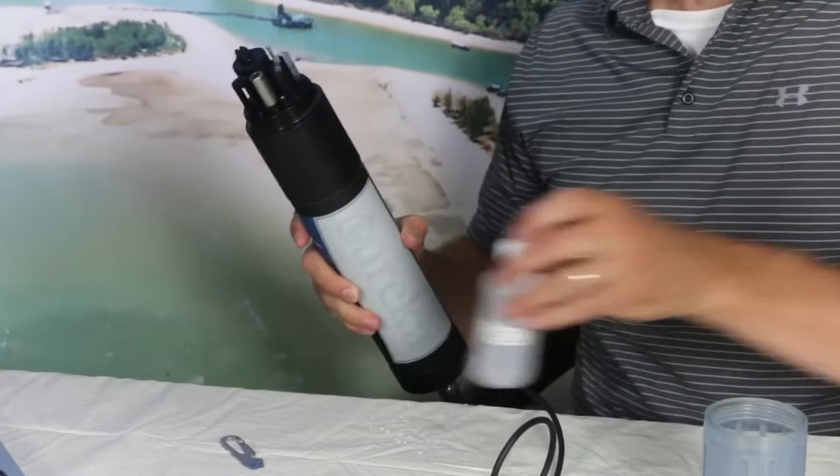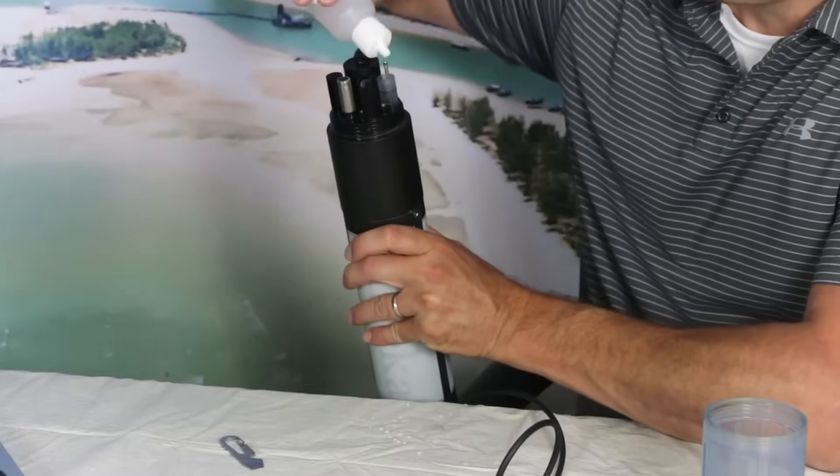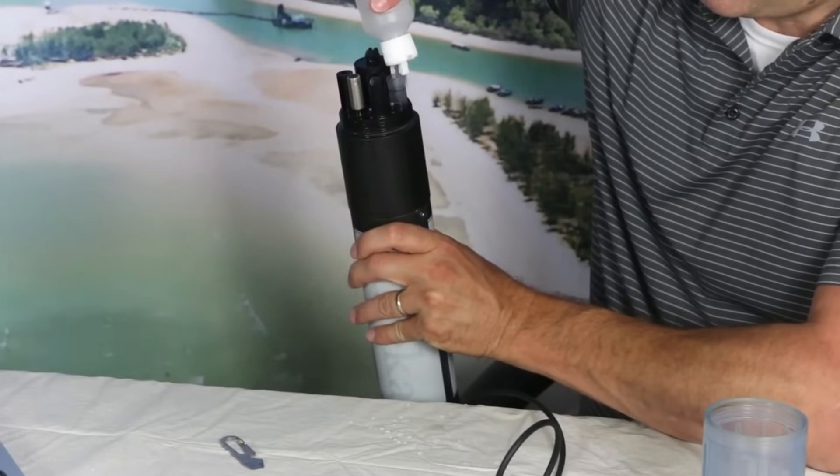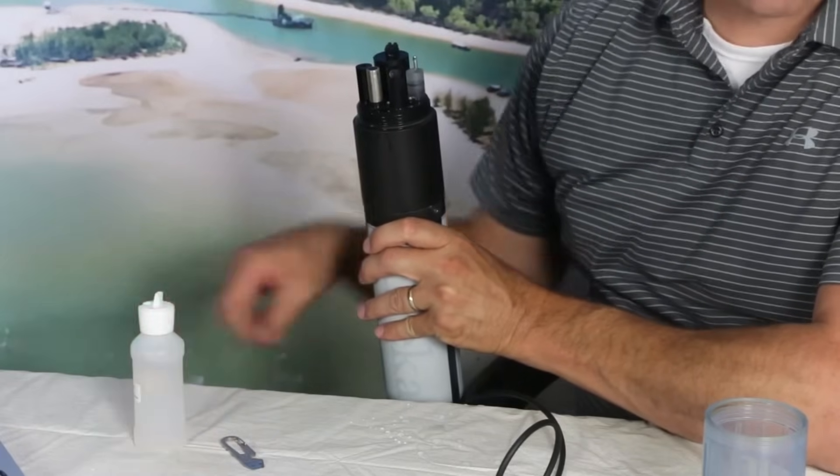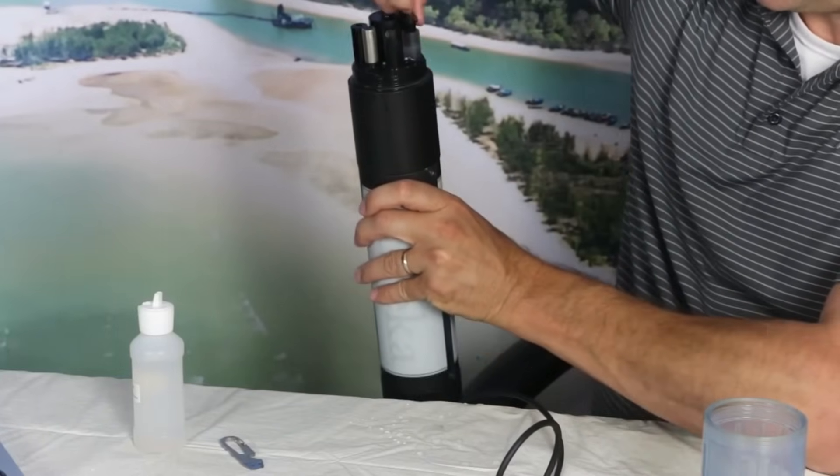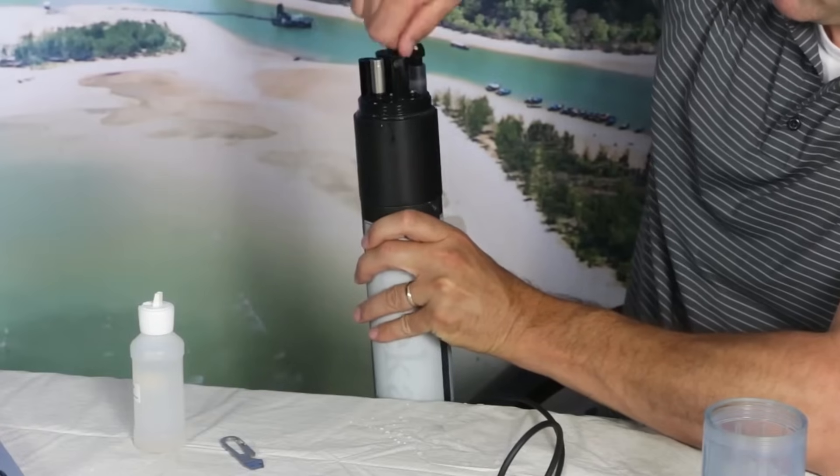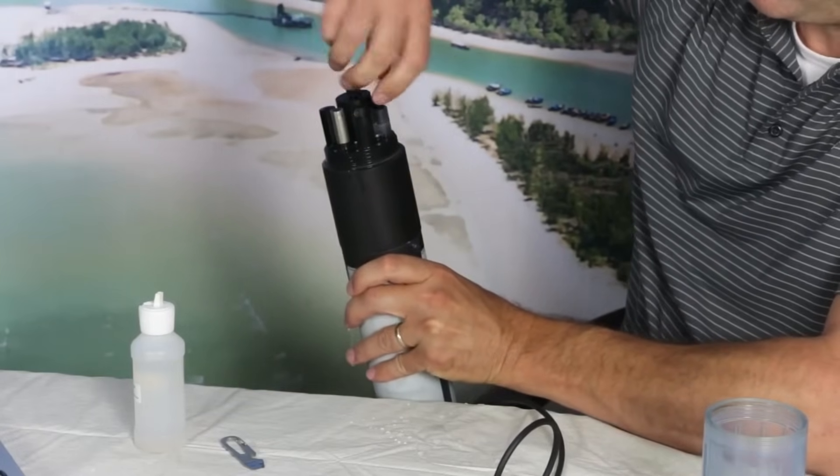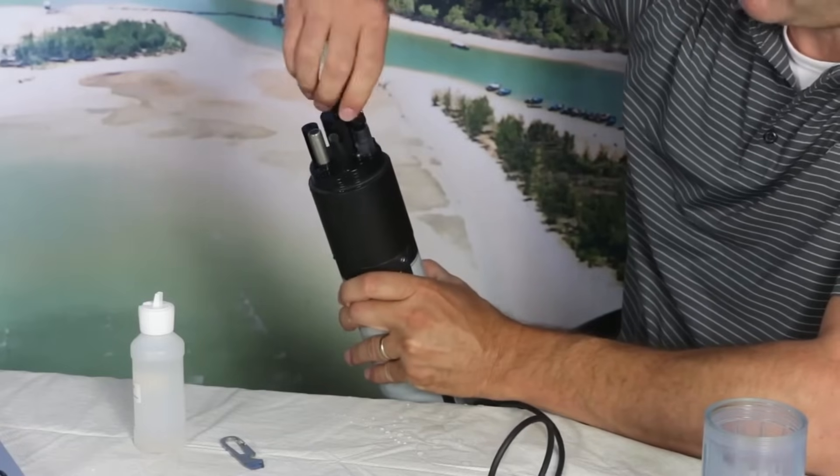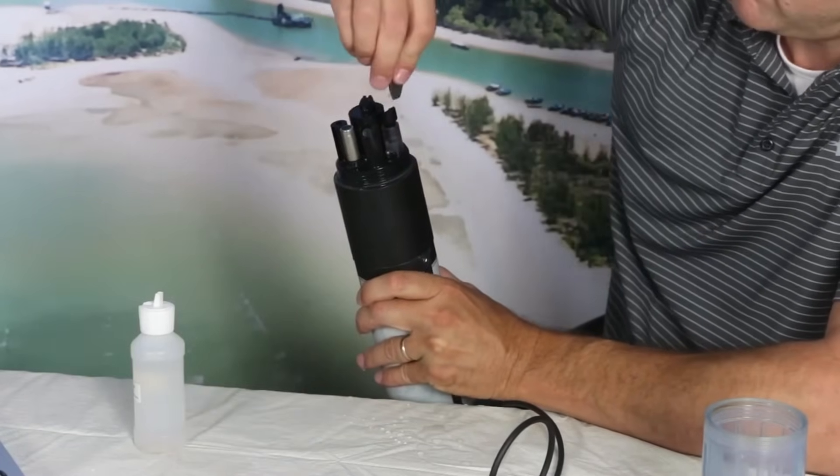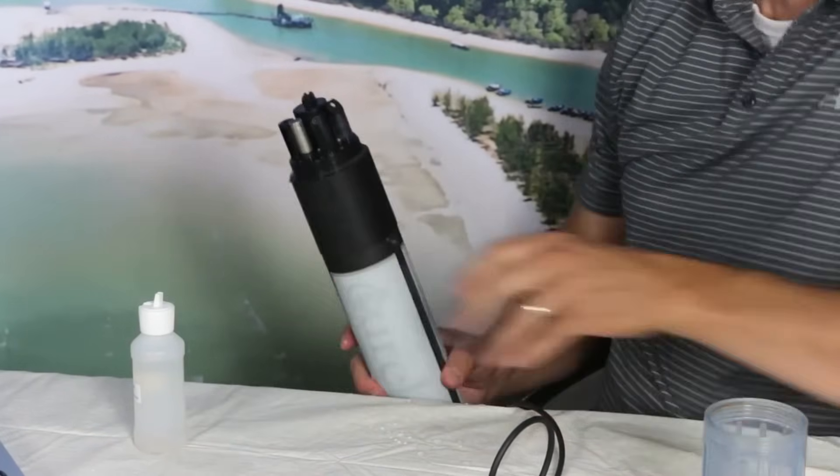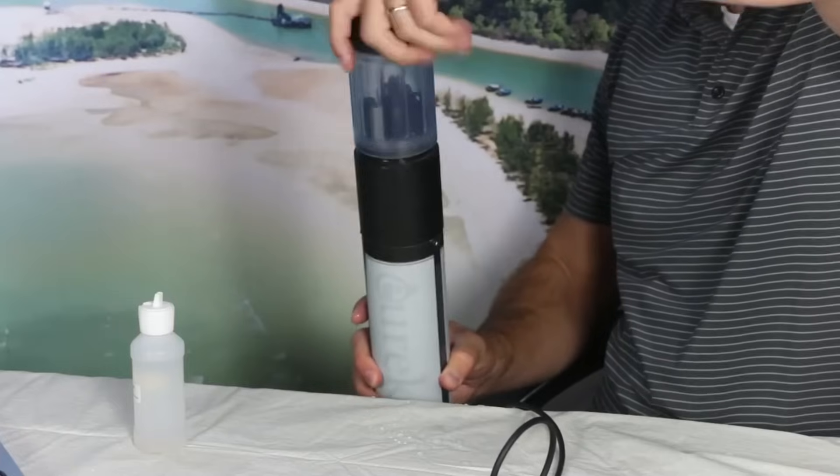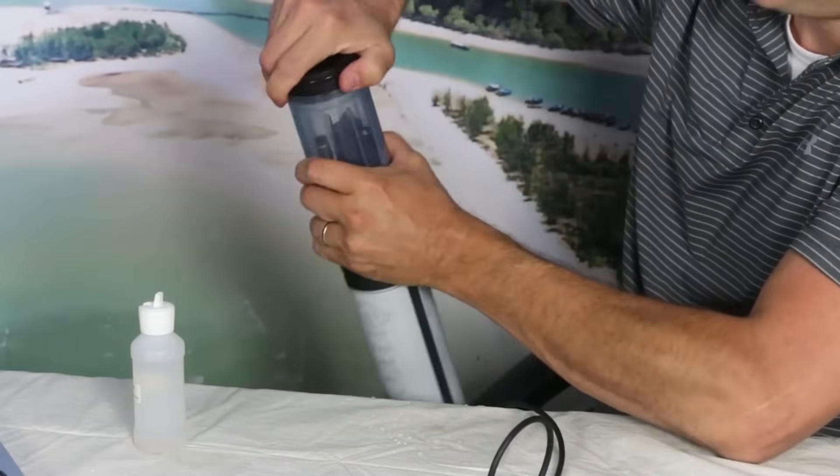I've got my reference electrolyte solution here, and we want to fill this up all the way to the top until it's basically overflowing, forming a meniscus. We're going to put our cap on. You will notice this electrolyte solution forcing its way out through this little white Teflon frit, just like that. Replace the cap.